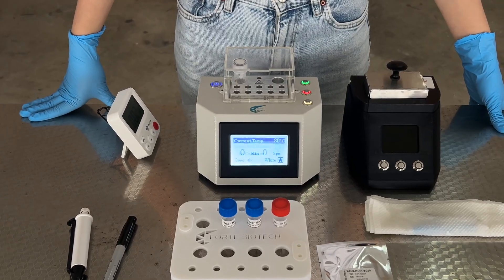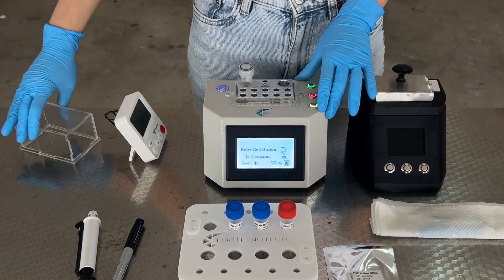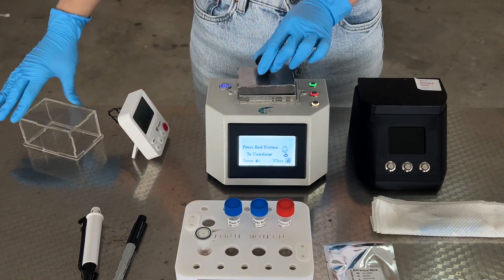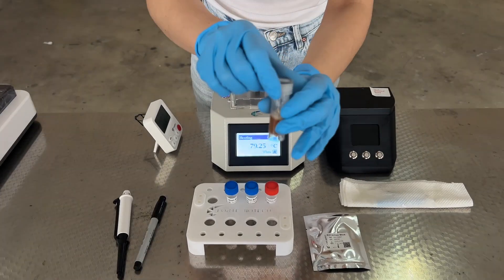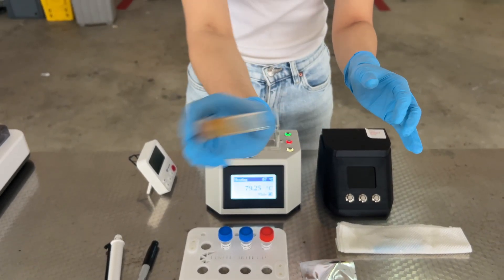After lysis is complete, take out the sample from the rapid heater, replace the lid and press the red button to cool the heat block for the next step. Open and close the lysis buffer to degas it and give it a mix and flick.